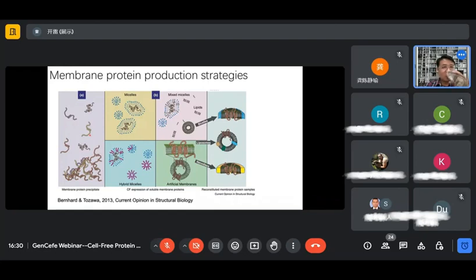In particular, 5' sequences of your gene, so that it can be well expressed. If the expression was achieved at a relatively acceptable level, we move to the next step: how we can get the membrane protein in its soluble form. And this can be achieved by introducing different hydrophobic environments, such as detergents or lipids.